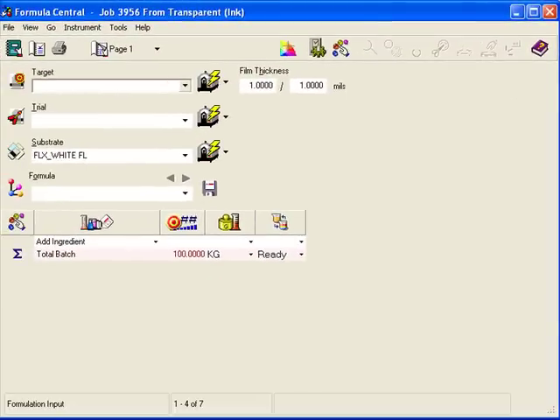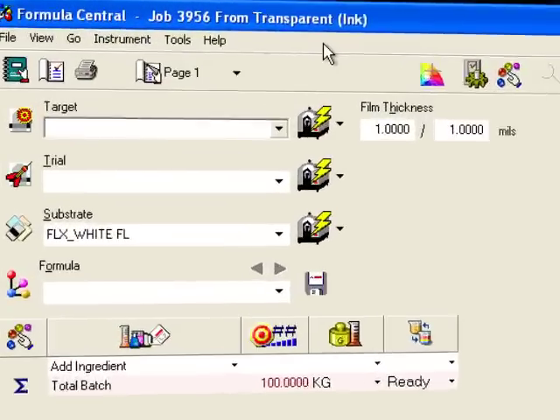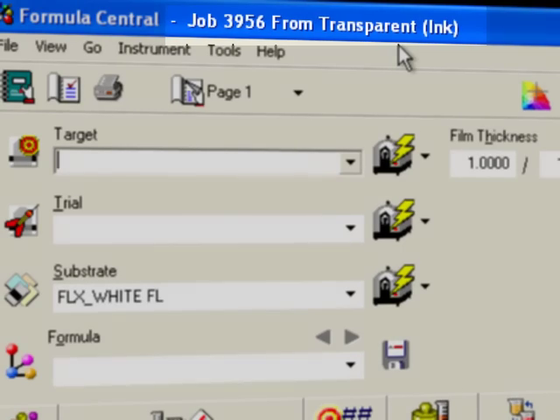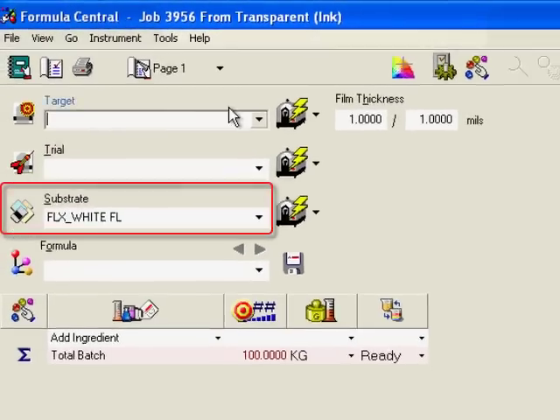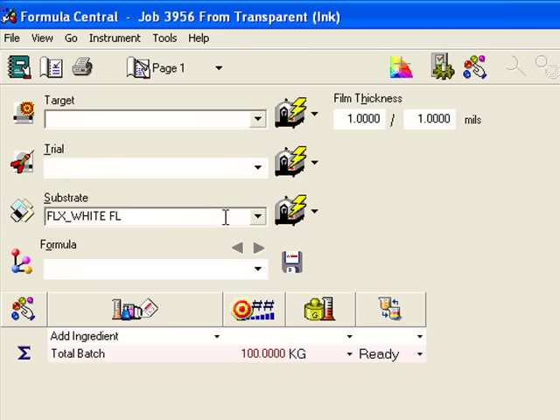When Formula Central opens, it's ready to work. The program made a new match job from a template stored in my user profile. The name of the job and the template it came from shows here in the title bar. This template is for matching transparent colors over a substrate.